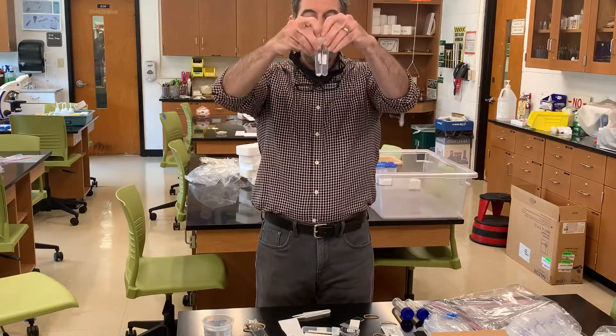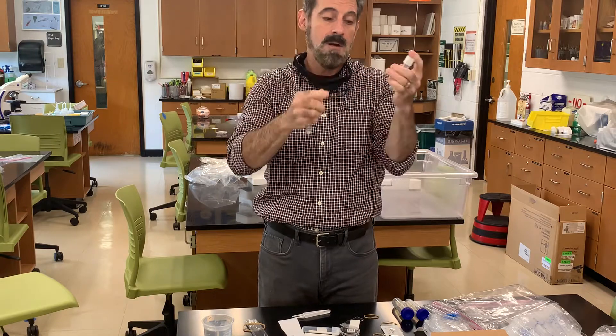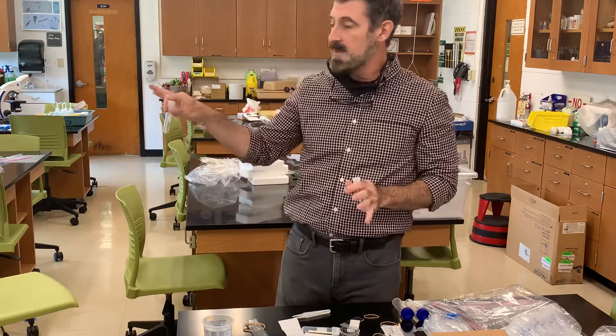There are also some small rounded test tubes with little caps that can pop off. They're sterile to start with — clean inside. Everything in your kit is sterile, brand new, and never been used before.